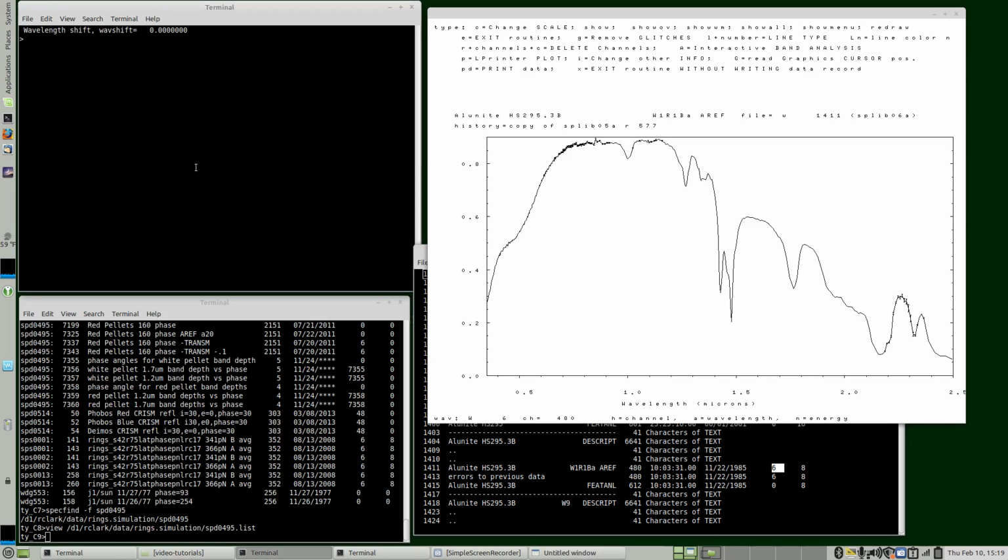So there are multiple line types that you can use in Specpr. So line type 0 is crosses with no lines connecting the data points, and error bars are shown. You can see the error bars over here easier. Line type 1 is the same as line type 0, but connect the points. Line type 2 is line with no points and error bars are not shown.